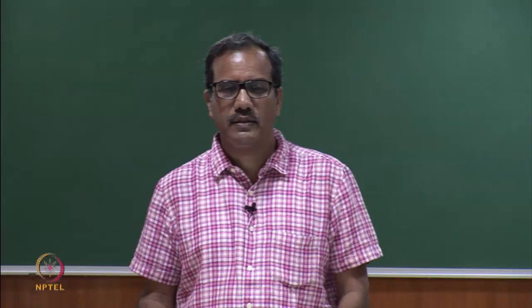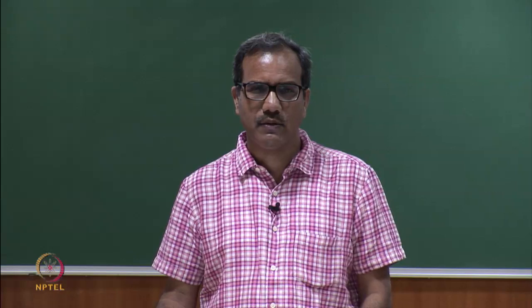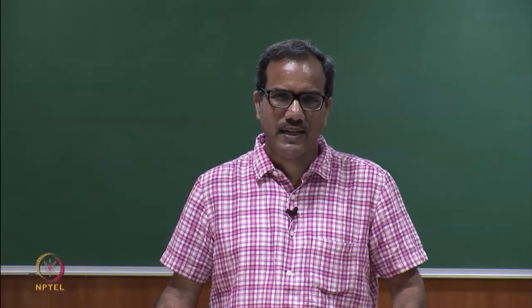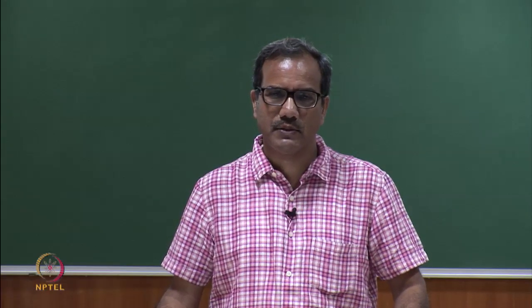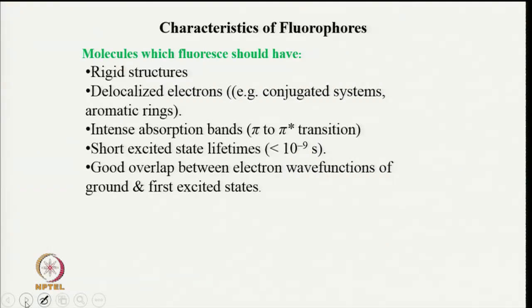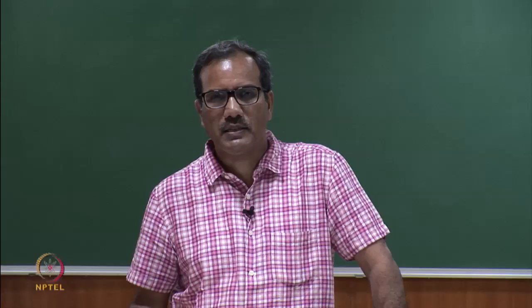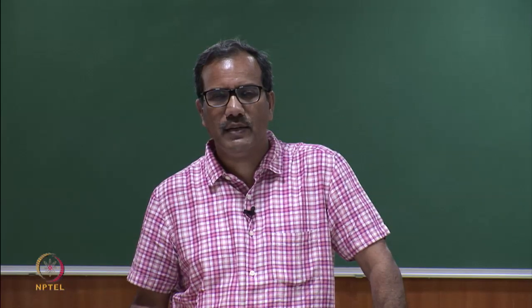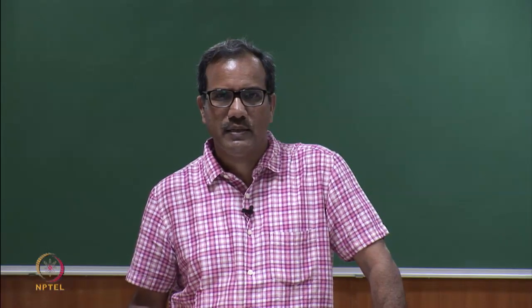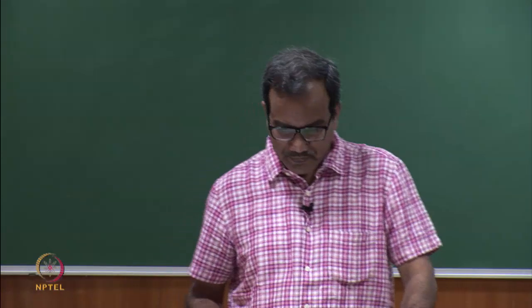In the last lecture, I discussed applications of UV visible spectroscopy and I started discussing fluorescence spectroscopy. We discussed a few basic things about fluorescence spectroscopy. We will again go back and have a recap on those topics and then I will discuss a few more concepts which are required to understand fluorescence spectroscopy.